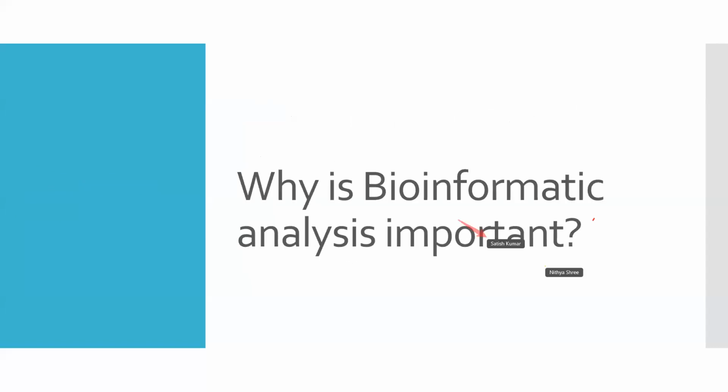So the first question that you would be wondering is, why is bioinformatic analysis important? Now, this word itself has 2 components. One is bio, another is informatics. So the data that we are generating from the experiments that we are doing are too many. Especially from genomics and proteomics, there is so much data that it would be humanly impossible to actually understand all of it. So we are applying a few computational tools to understand and make sense of that data.